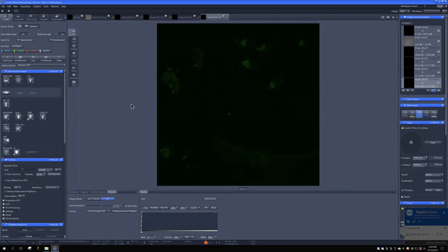So, what we are going to do today is, our cell is done with the TMRE, and now we want to track our cell with TMRE. First things first, we're going to locate where the cell is. So here we are going to use the wide field imaging to locate the cell. The intensity of the wide field LED usually is set to 10 first.